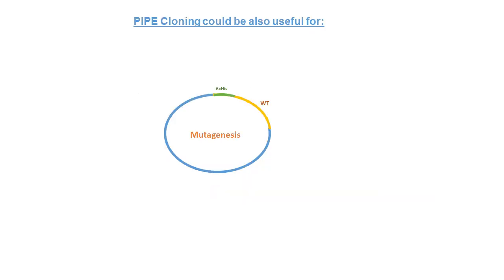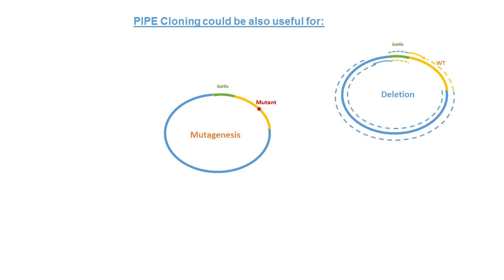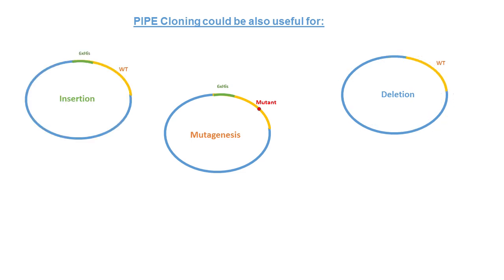PIPE cloning can be applied also to produce a single point mutagenesis. In this case, you don't need to buy any specific kit, but you can just design two primers containing the mutation and perform a vector PCR, digest the reaction with DpnI, and transform your plasmid into the E. coli strain. In the same way, we can easily also perform a deletion or insertion of a small fragment, maximum length about 15-20 amino acids.